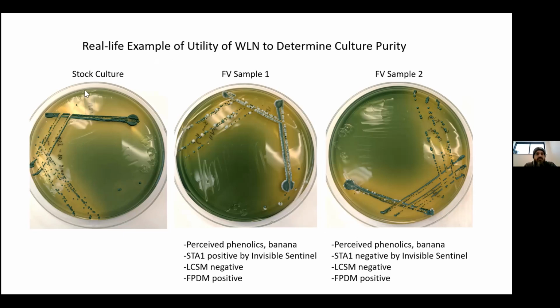cells that we saw in their stock culture of their house strain. You can see all these white colonies popping up. So it was pretty apparent right from the beginning that they had a mixed culture here.